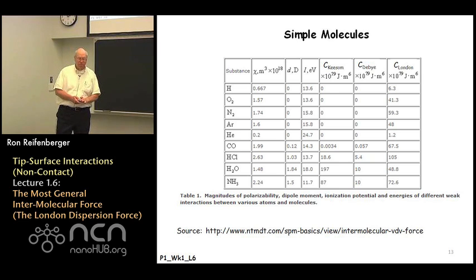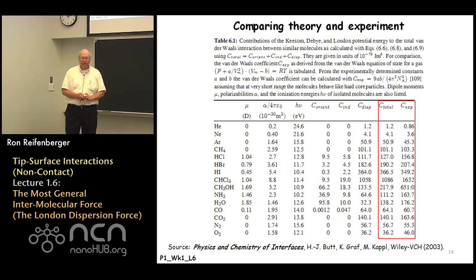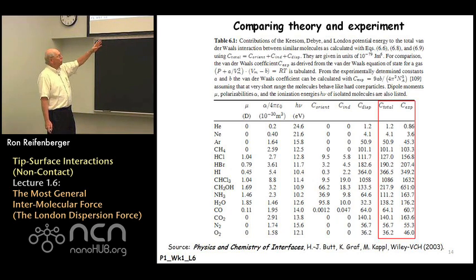In this particular slide, I draw your attention to a comparison between experimental measurements of these constants and the theoretical calculation of these various contributions for the Keesom, the Debye, and the London dispersion force.